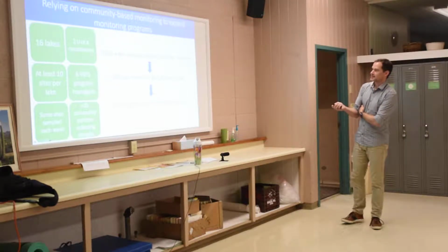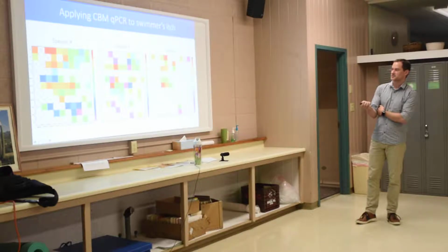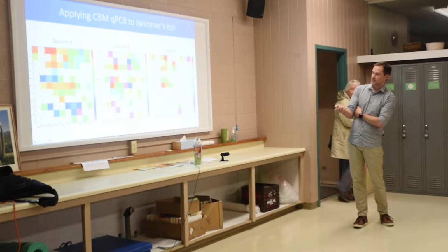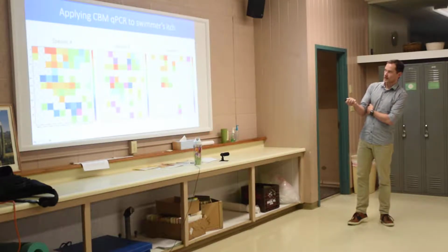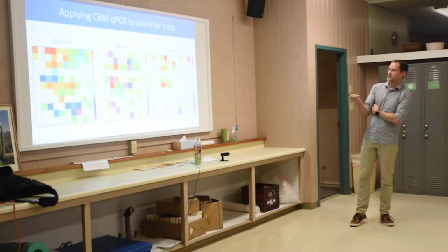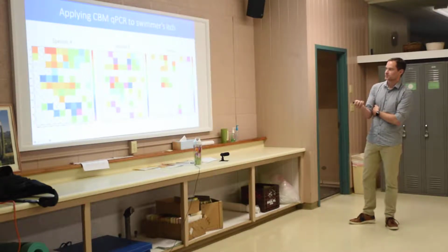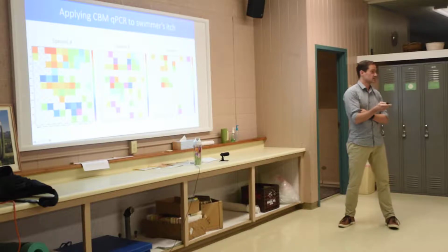And just to give you an idea of what that looks like, this is just some data from that program that we're starting to see in a heat map form, where we have sample collection date on the bottom axis, and then we have the site at the lake on this axis. And then the color moving towards red means you just have more parasites there. And so what we have this broken down to is species A, B, and C. This is not analyzed enough for us to give you the nitty-gritty details on this, so I don't want to talk about what it is or what's going on here, what lake it is or anything. But what I want to show you is that there are some locations that we have really high abundance of parasite species A, but very little abundance of parasite species B.